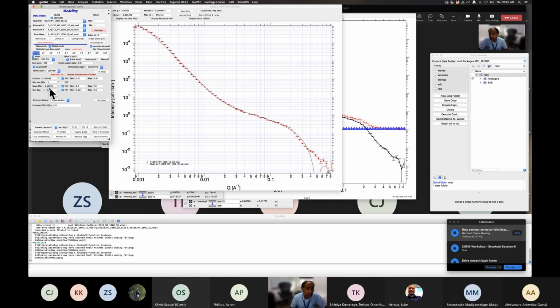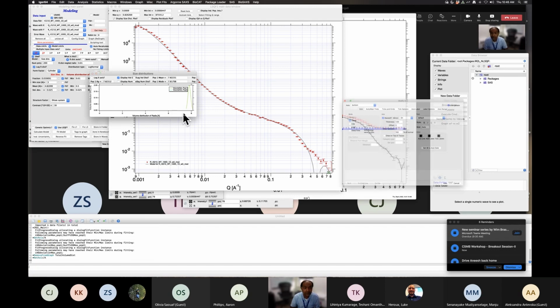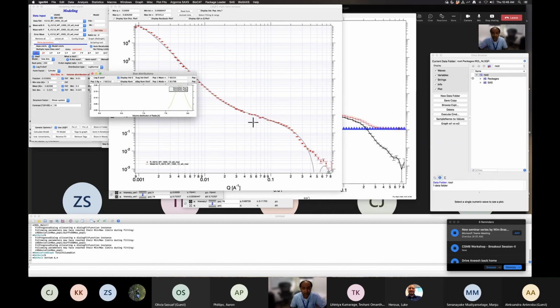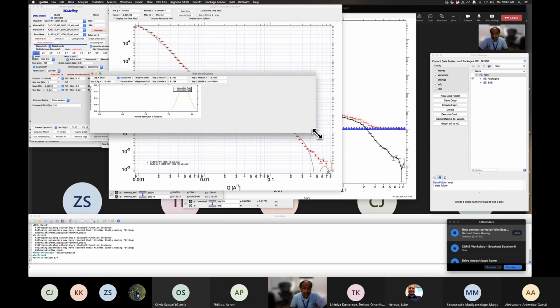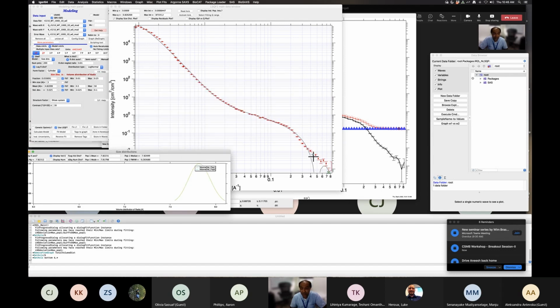And to see the distribution, you can click on that, and that'll give you the distribution. I can remove the red one, and then say from 6. Okay, so now this distribution is basically monodispersed, right? Because it's assuming it's not able to pick up this piece.